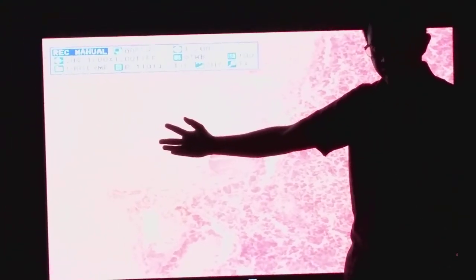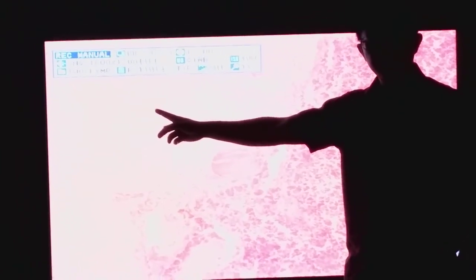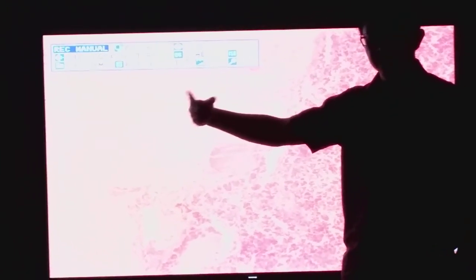That is why what we are seeing in the pars nervosa will only be the axons containing the secretory granules of the two. What is the specific term for the aggregates of the secretory granules in the pars nervosa? Herring bodies. Now, unfortunately, it will be very difficult to view the Herring bodies.